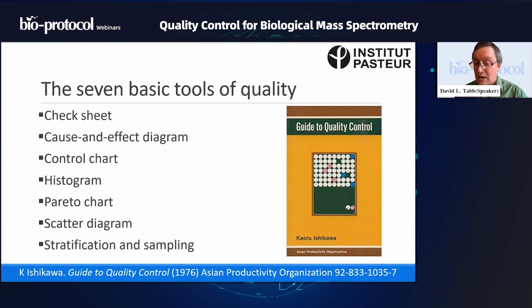The short version is that we certainly benefit when we are able to do a measurement for intensity at high resolution. In the old days, we might have used something like a triple quadrupole mass spectrometer to do a quantity for something, but triple quads are not extremely mass accurate, so you might very easily mistake one peptide's intensity for that of another.